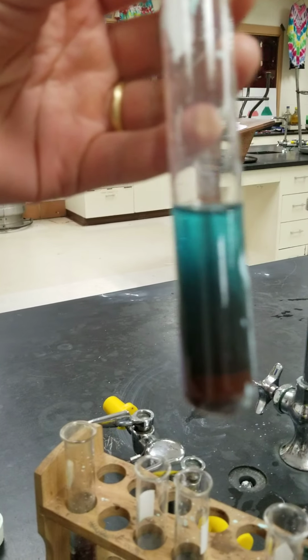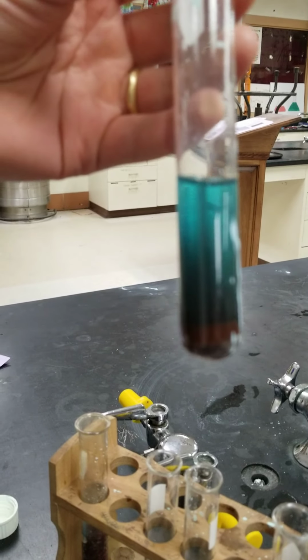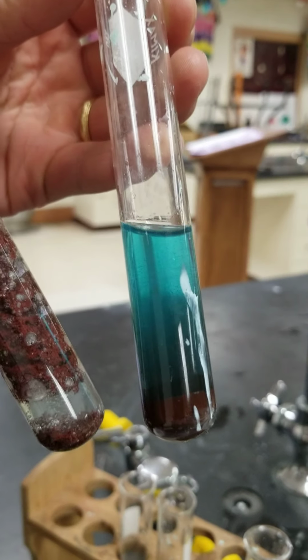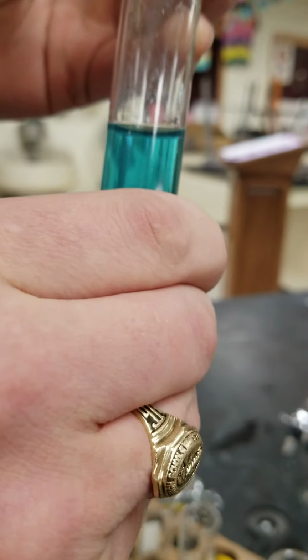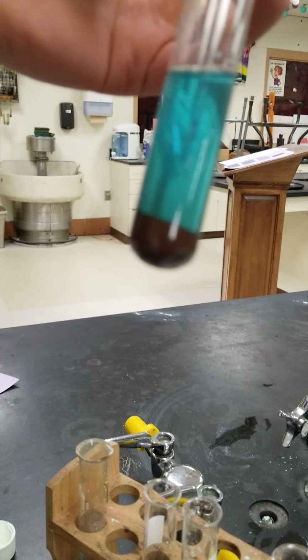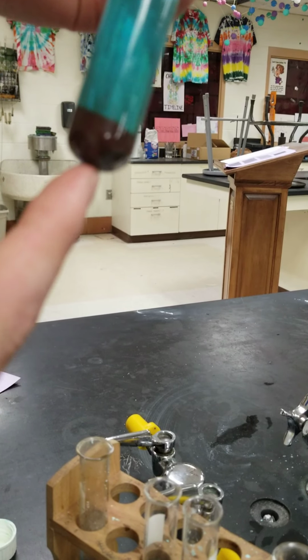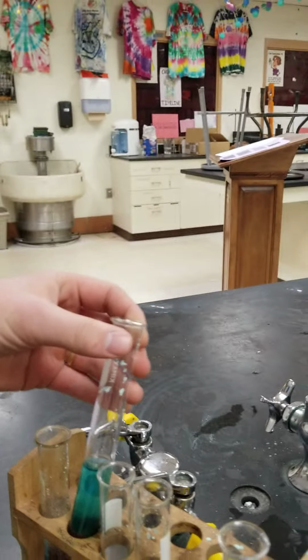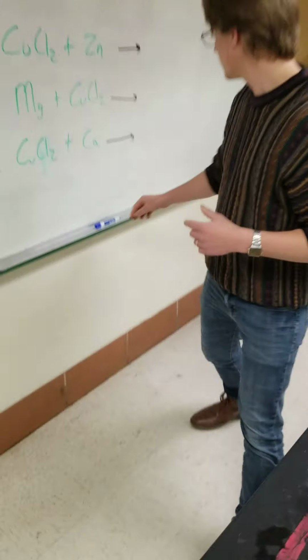So as we're waiting for this to settle, notice you don't see any bubbling like before, even if you compare. This one's still bubbling. If you feel this one, there's no heat, and it's not cold either. You can see the copper on the bottom looks pretty much the same. So nothing really changed. Now this reaction, nothing happened.